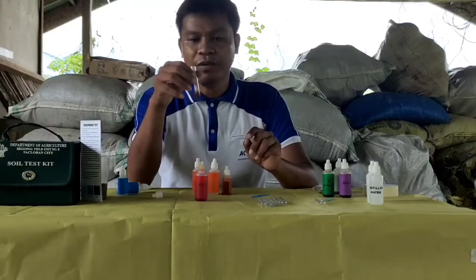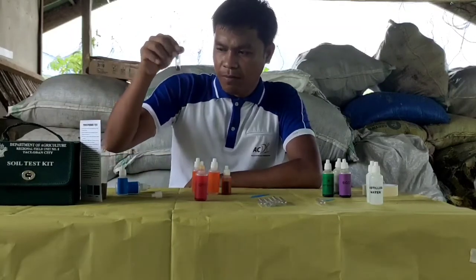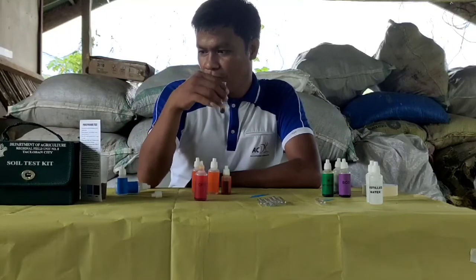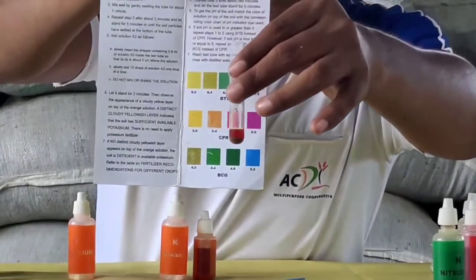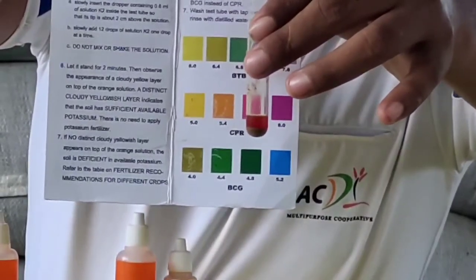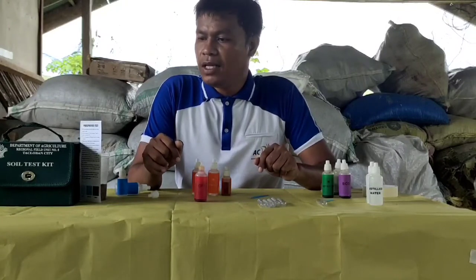3 times for 2 minutes. Magpaabot tayo ng 2 minutes. After about 2 minutes, let the tube stand for 5 minutes. After 5 minutes of standby, our conclusion here is the soil pH of our sample is about 5.8.